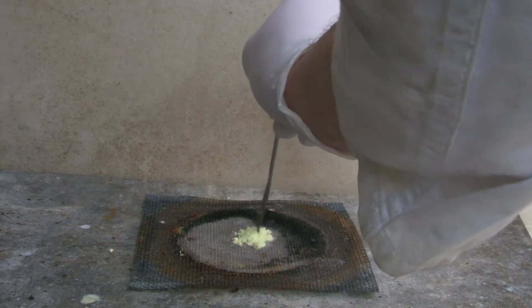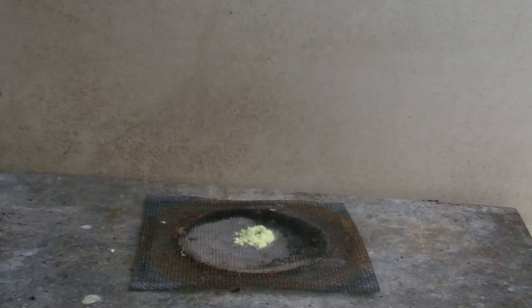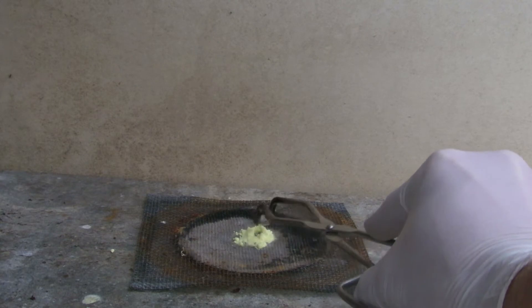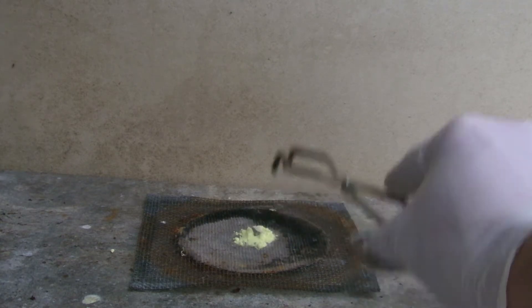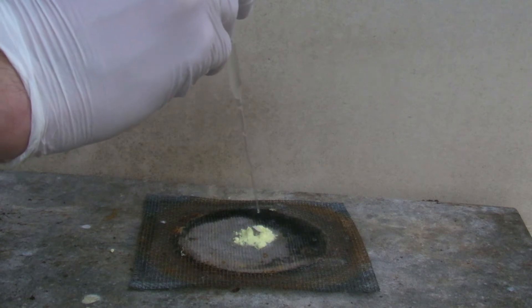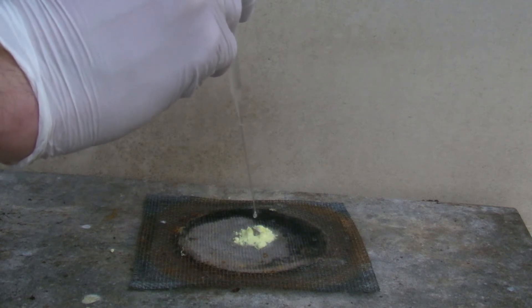Then some sulfur is put on a fireproof surface and a small piece of sodium is added on top. At the end, a drop of water is added on top of the sodium and an exothermic reaction takes place.